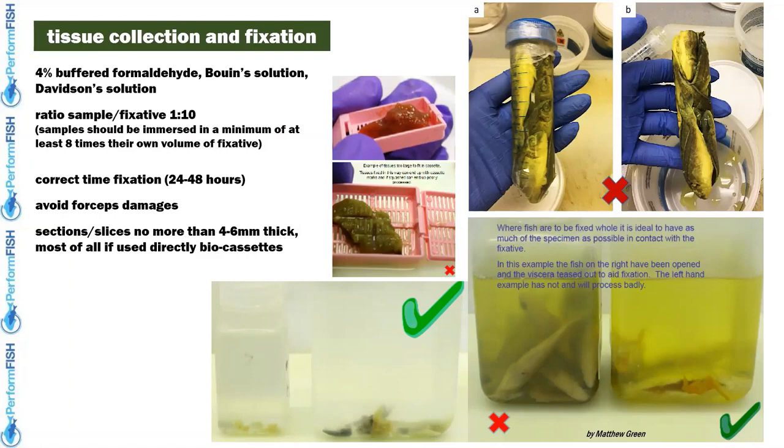Also for the histology involved in the project, there is a protocol. But as we see in this picture, the guidelines given were not always followed, probably due to the inexperience of the staff. Here you can see, most of all in this picture, what I mean, of course.